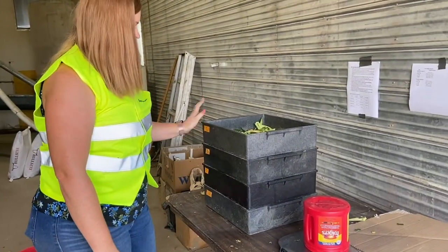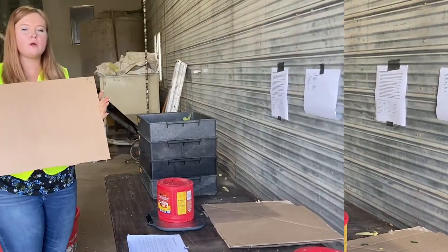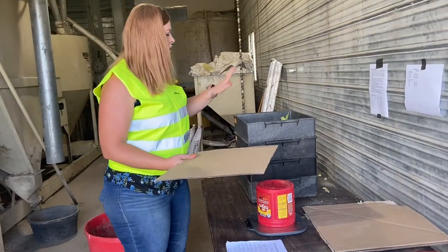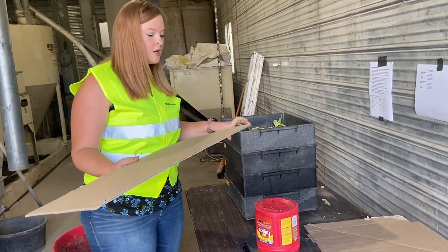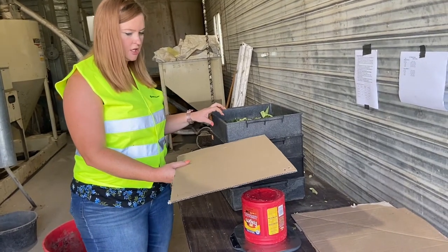Now we just measure what is on each one and calculate. We weigh the little cardboard ahead of time and it's labeled number 1 because it goes with our tray number 1. We'll also weigh tray number 1 together so that it's easy for quick processing and calculations so we know if we need to change anything on the chop line.